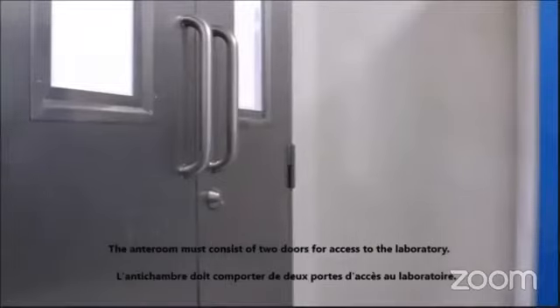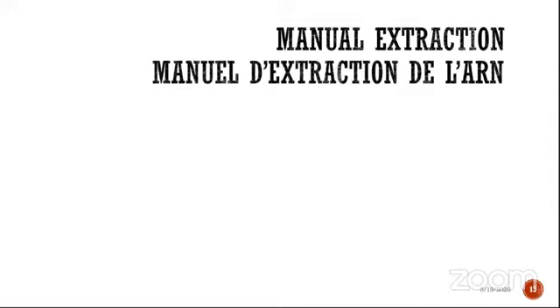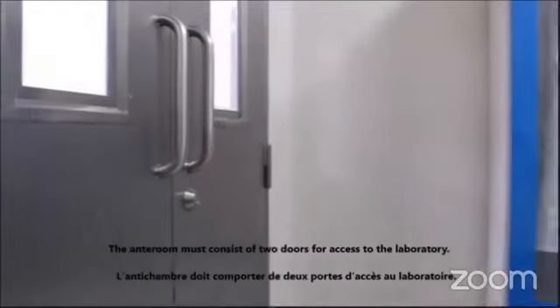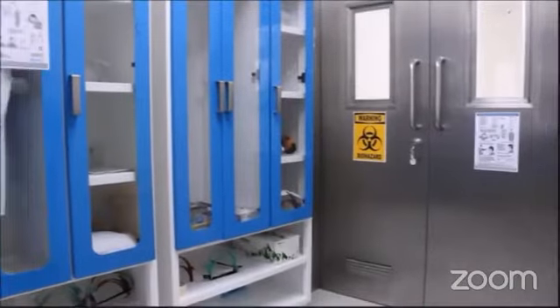Next is the anteroom. The anteroom must consist of two doors for access to the laboratory. The doors of anterooms should be interlocked or alarmed, so only one door may be open at a time.